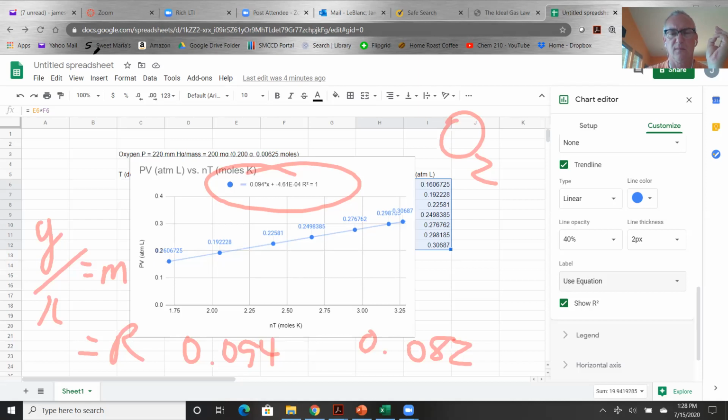It's R squared. No, the R squared is 1. That's a separate number over there. I'm talking about this one right here. What is that? When you fit... B. Nope, it's B. That's right. B. Remember, when you fit a straight line, you get y equals mx plus B. And what does B represent? What is B? Anyone remember?